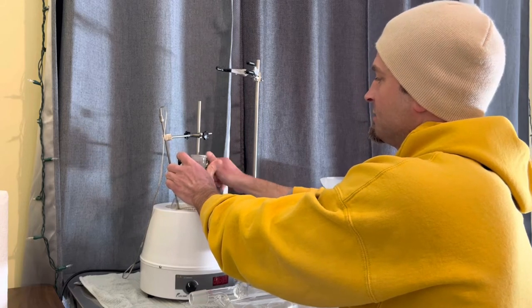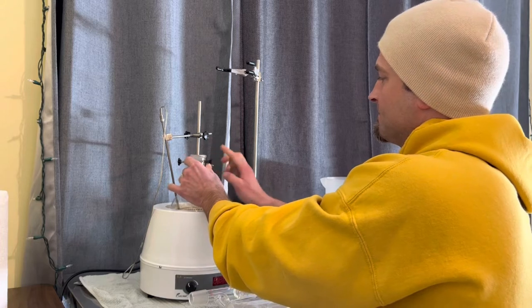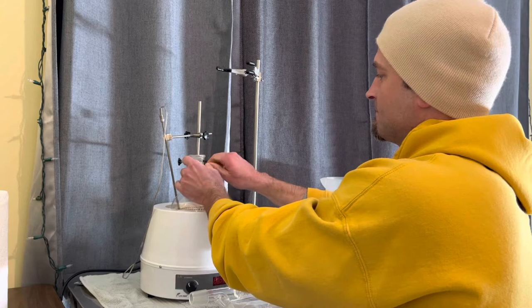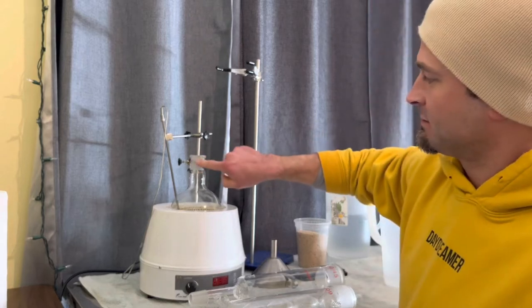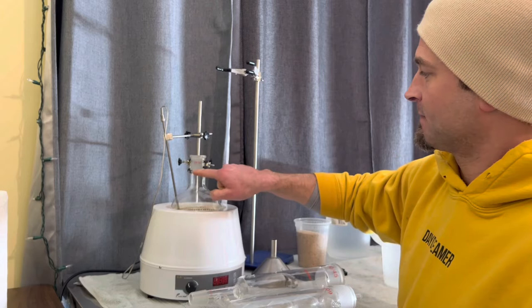Adjust these. So they're sitting in between this area, between the lip, right down here.